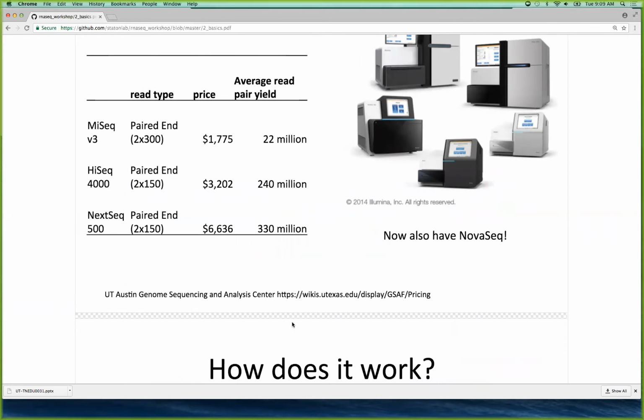That's it, right? Yeah. So you're almost never sequencing like one cell. You shoot for a homogeneous population, but you don't get it, right? Like if we take a whole leaf and do RNA extraction, we get lots of different things going on in different parts of the leaf. You're going to cover the whole genome as well as get a good range of expressions. Yeah, and I'll talk about that. There's some debate. I think 10 million reads is about the sweet spot for the statistics. The statistics seem to work out well at 10 million.